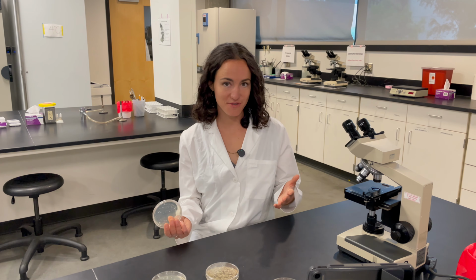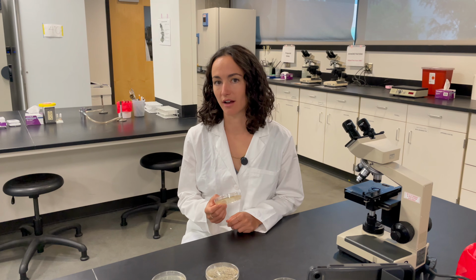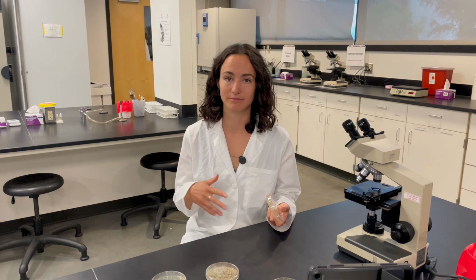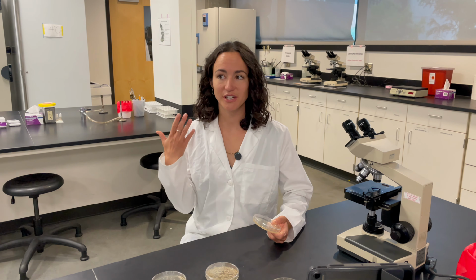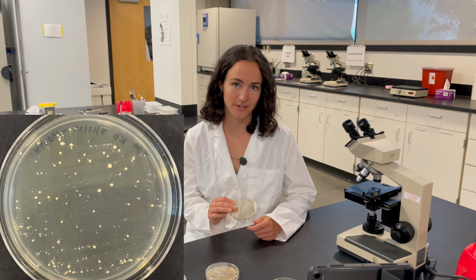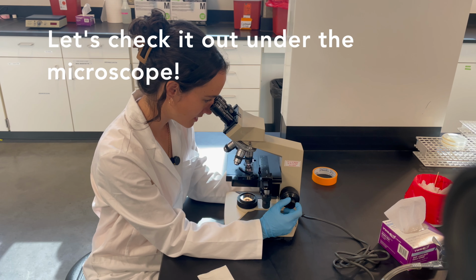Have you ever had strep throat? Because I bet now you can guess who the culprit is. In that case, it would be Streptococcus pyogenes. But not all Streptococcus species are pathogenic or disease-causing for us. We actually have a ton of Streptococcus species in our mouth. I bet I'd find a ton on this plate if we check it out under the microscope. They really love this wet, nutrient-rich environment.